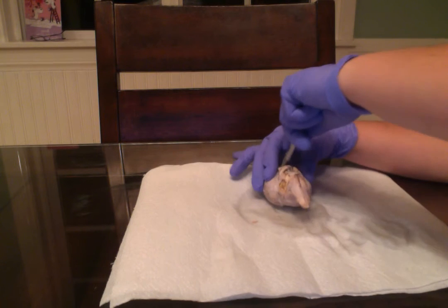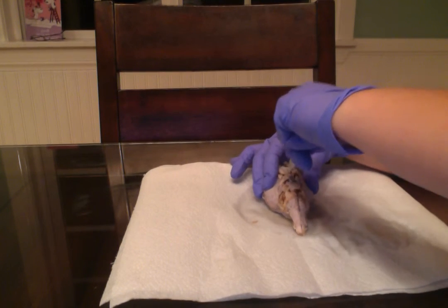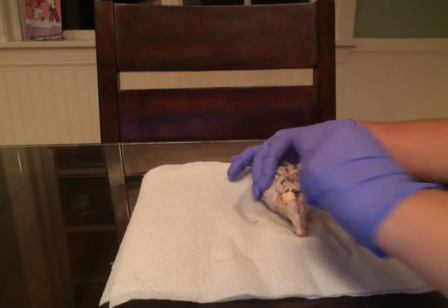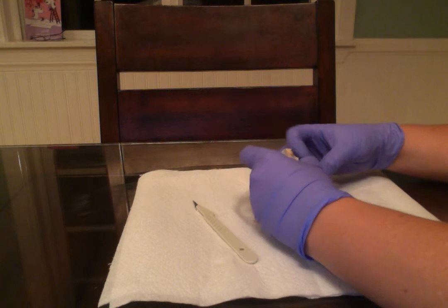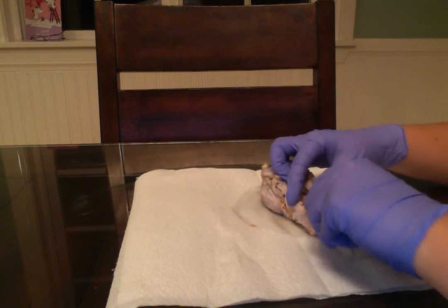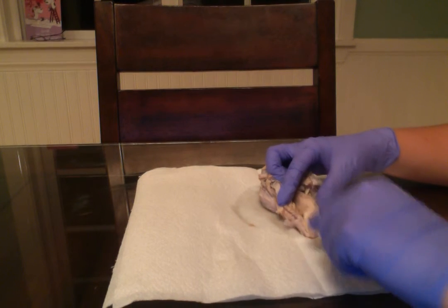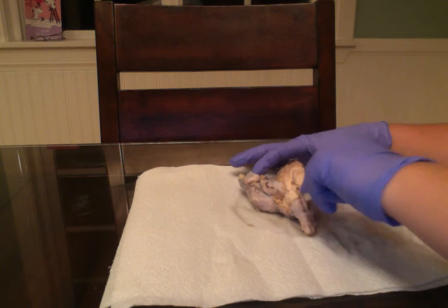So I'm going to just cut this guy right down the middle so that we can look at the sagittal section. I need a little bit more cut here. And here, there we go.